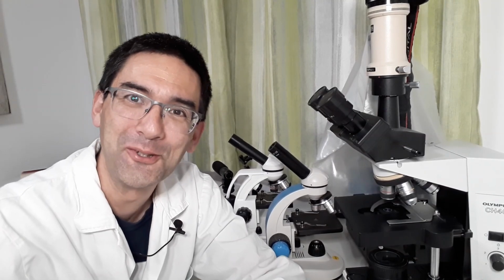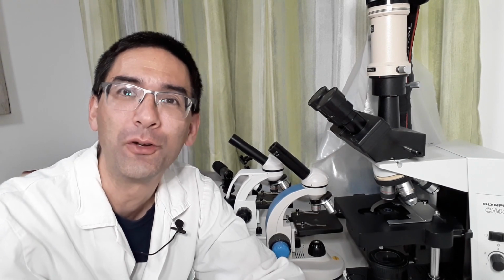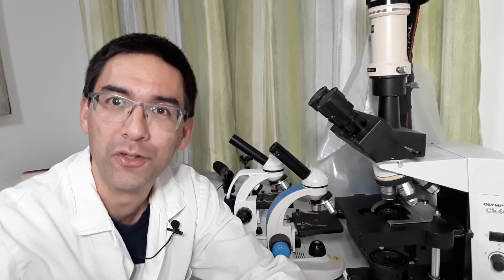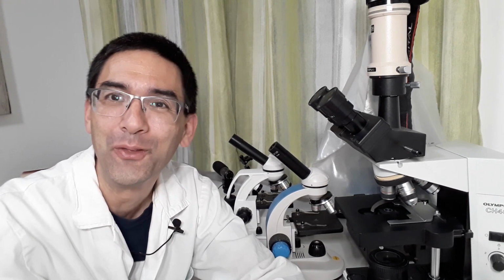Hi Microbehunters, Oliver is here and I wanted to quickly answer a short question concerning the functioning of the condenser and also of the Köhler diaphragm, also known as the field diaphragm, because both of these diaphragms have an effect on image quality.